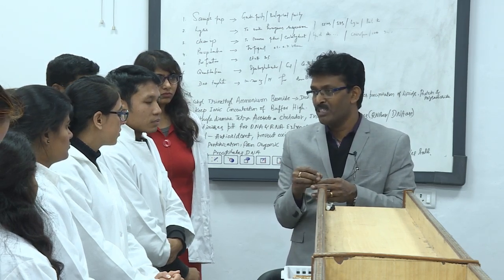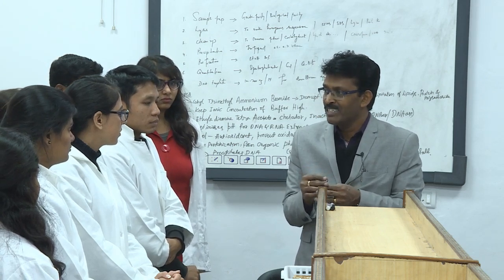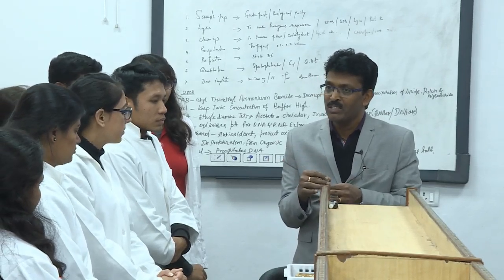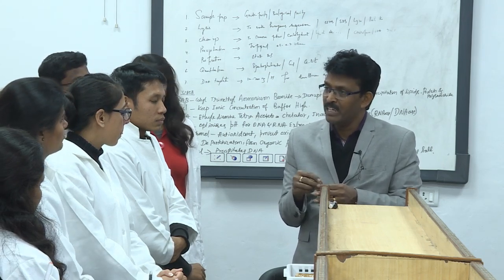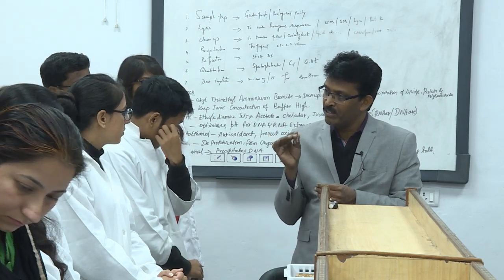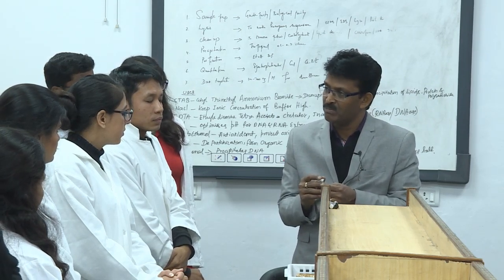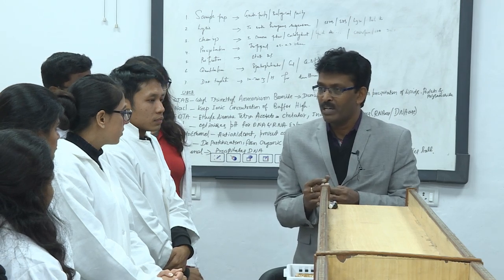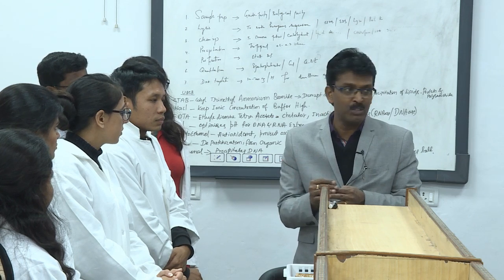This is very, very important. Otherwise, many times you yourself will be confused about what you handled a month ago. Those kinds of confusions can be resolved. So a proper coding system is very important. Of course, we know that at the end of the day it is going to be identified up to species level, and you are going to give a species name for the sample you are handling, if the purpose is to identify an organism. So here comes the question: if two different Bacillus species, let us say subtilis, come in your collection, then you need to segregate them.